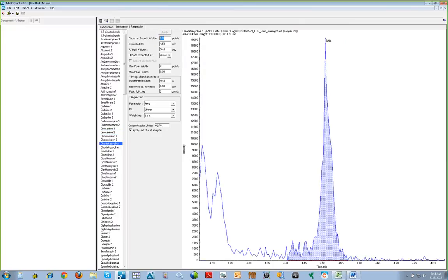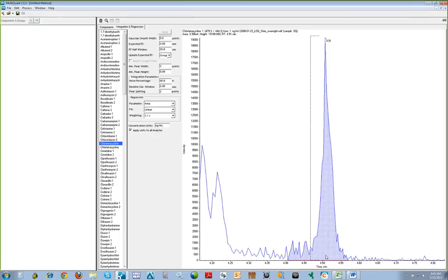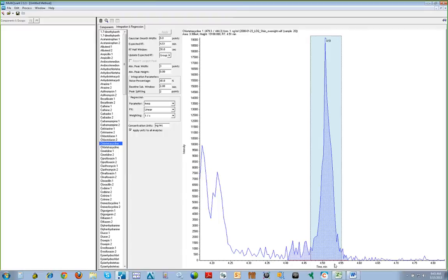Making changes to the peak integration parameters is also very easy. For example, when we review chlorotetracycline, some additional baseline noise is included in the integration. This can be adjusted by selecting the retention time range of the peak to be included in the integration and adjusting the integration parameters.